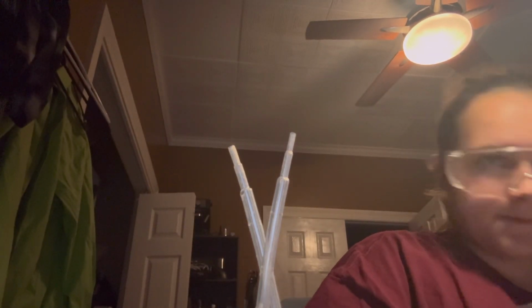So let's test the pH of this well now. It looks to be around a pH of 3 now, after 2 drops. We'll do it again. Alright, so 2 drops of the 6 molar of HCl.